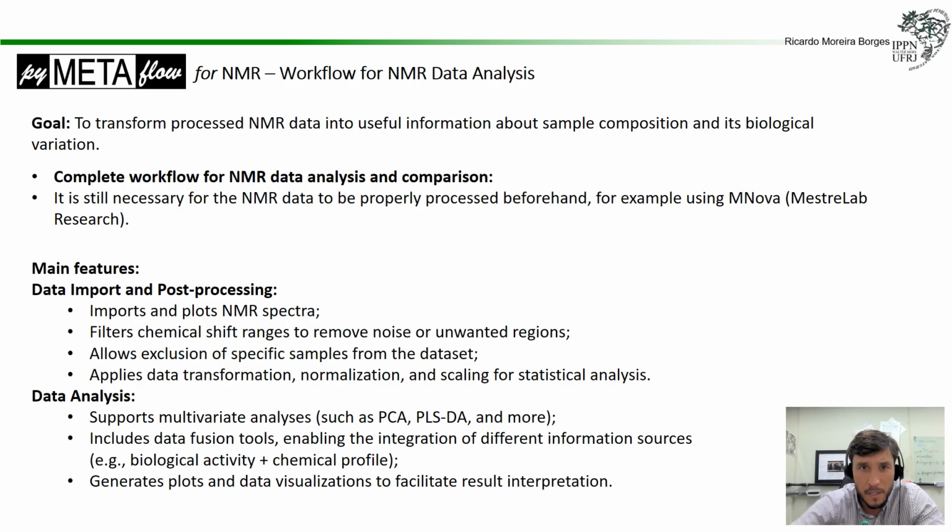So the goal here is to transform processed NMR data into useful information for sample composition and biological variations. It's meant to be a complete workflow for NMR data analysis and comparison, right? But it still needs the NMR data to be properly processed beforehand, like using MNova, for example, right?